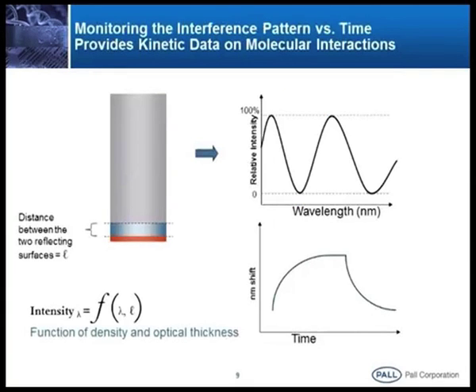Now, as the molecules start binding, in real time you can see a curve like this. This is what the readout is. This is the background, this is the readout, okay. See, this is what we call the association phase. As the molecule binds to the binding partner, we can see the curve rises. We call this association. Once we bring the same sensor back to the buffer, the molecule bound to the receptor gets washed off, okay. Now this phase we call the dissociation phase. So dissociation by association we call the affinity.